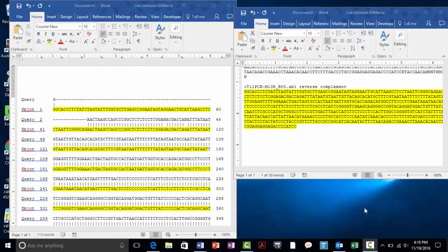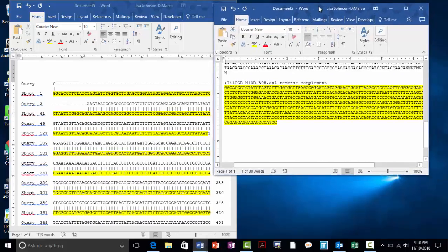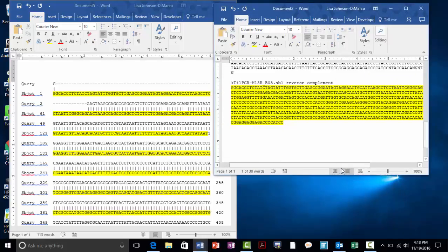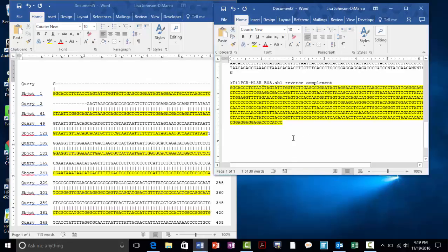All right, I'm back. So I finished highlighting the reverse primer sequence in my alignment, and I also opened up a new window that I can compare side to side the reverse primer sequence, the whole sequence together like this on its own. And so what you want to do is look through the sequence here and decide if there are any Ns in the middle that you may want to go and check in your alignment to see if the opposite sequence, the other sequence, gives you a base there. So I don't see any Ns here, and what you're doing is you're building a consensus sequence. So you're building your best, strongest, longest, and cleanest sequence to do the BLAST.